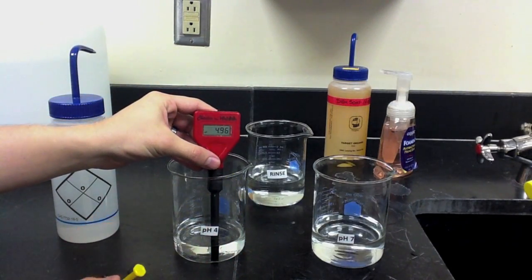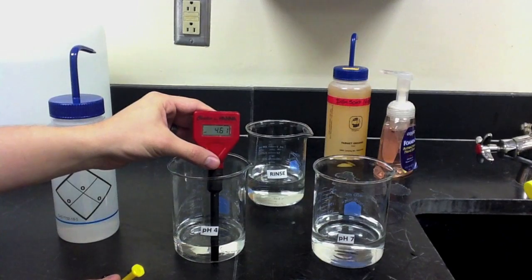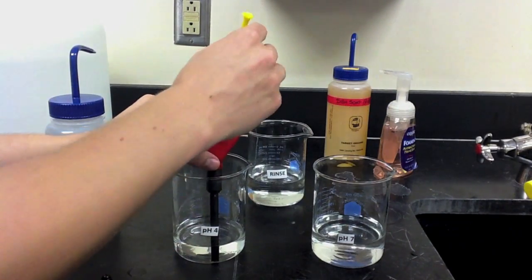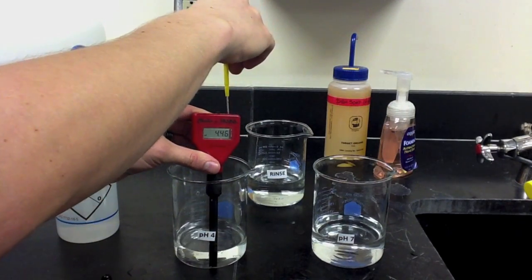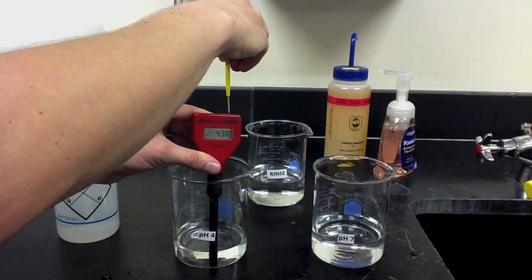Similar to adjusting it to a pH of 7, we'll see what the current pH reading is and adjust appropriately. Because it's above 4, we're going to adjust the screw counterclockwise until the pH reads 4.00.